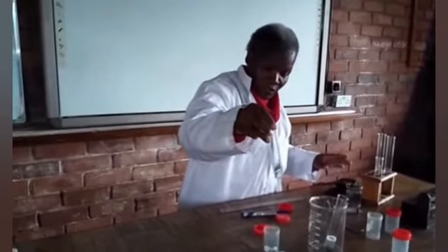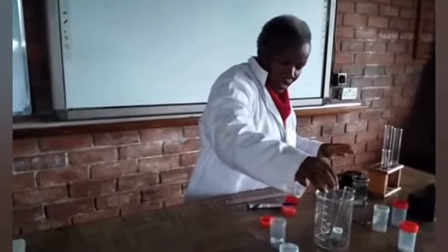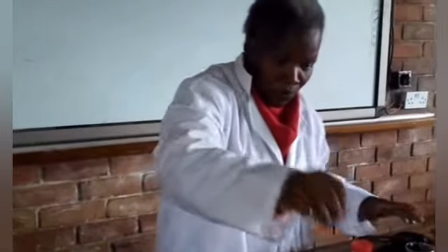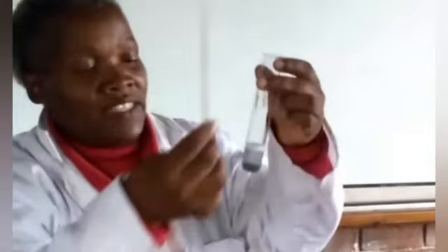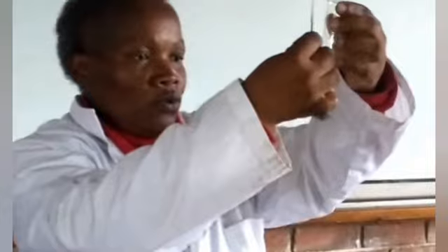for zinc. Then I'm going to add my iron into 4 minutes is now up. Let me measure for zinc so that the time factor remains the same. I'm going to start measuring from where the froth is beginning to where it is ending now.